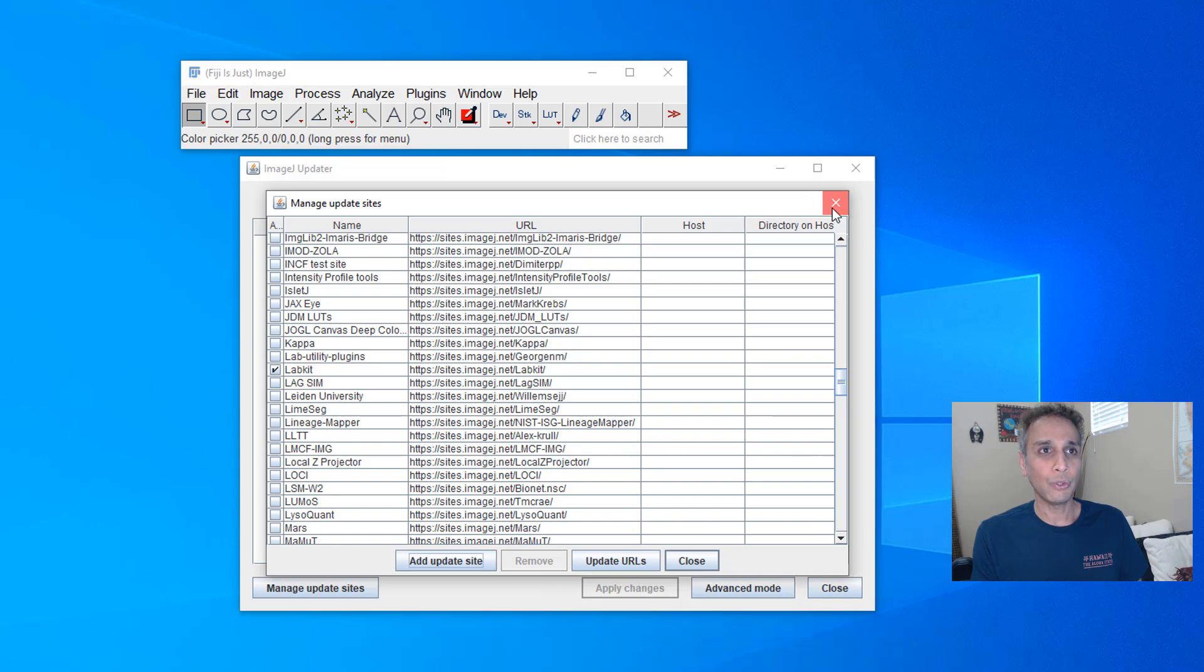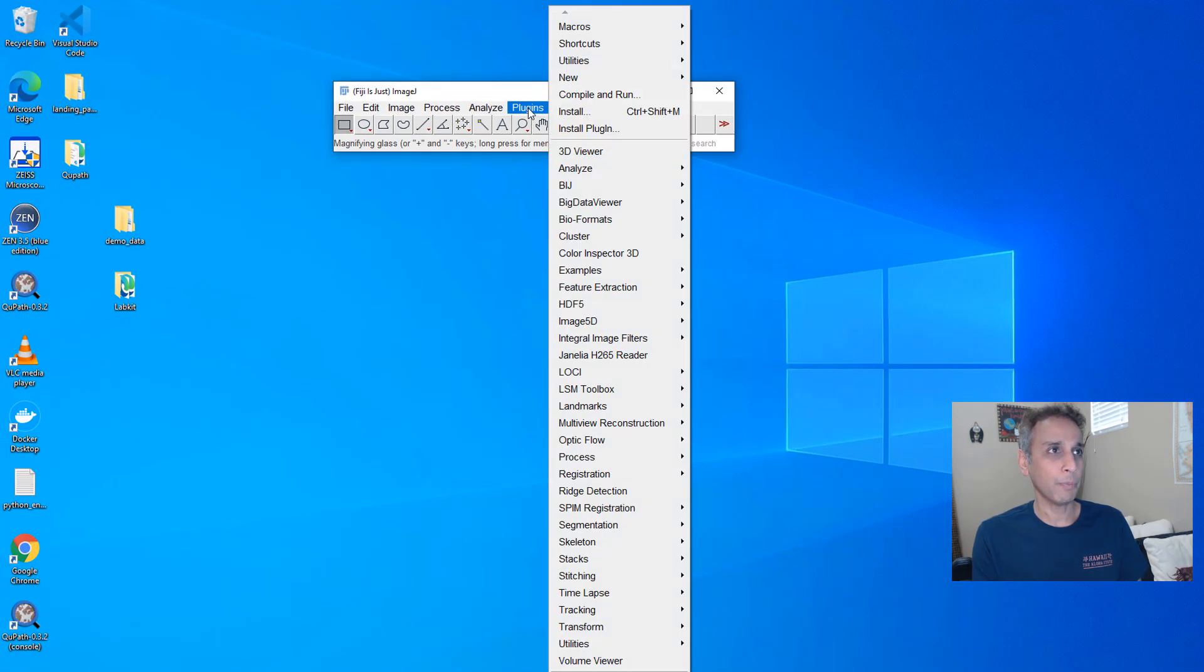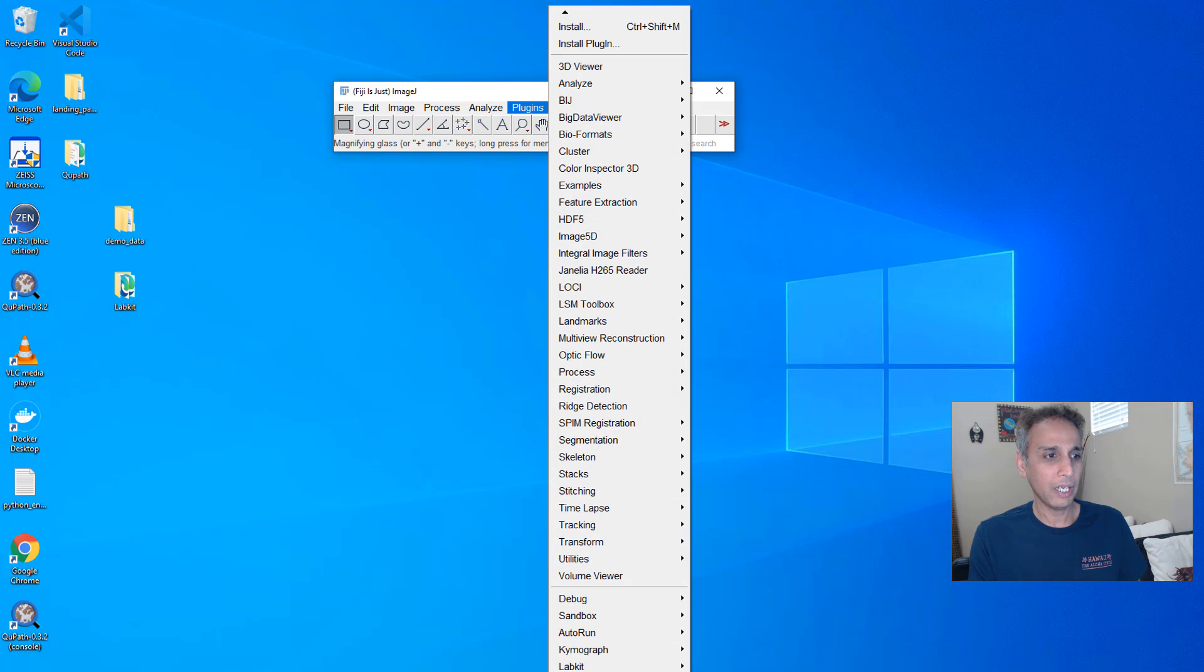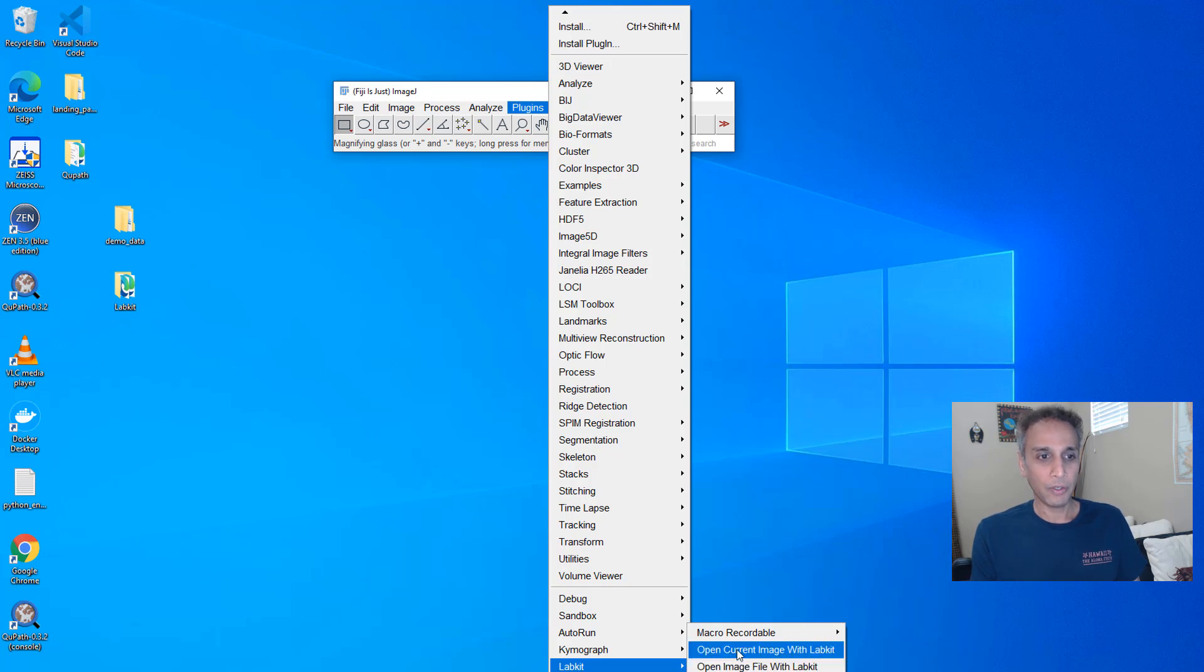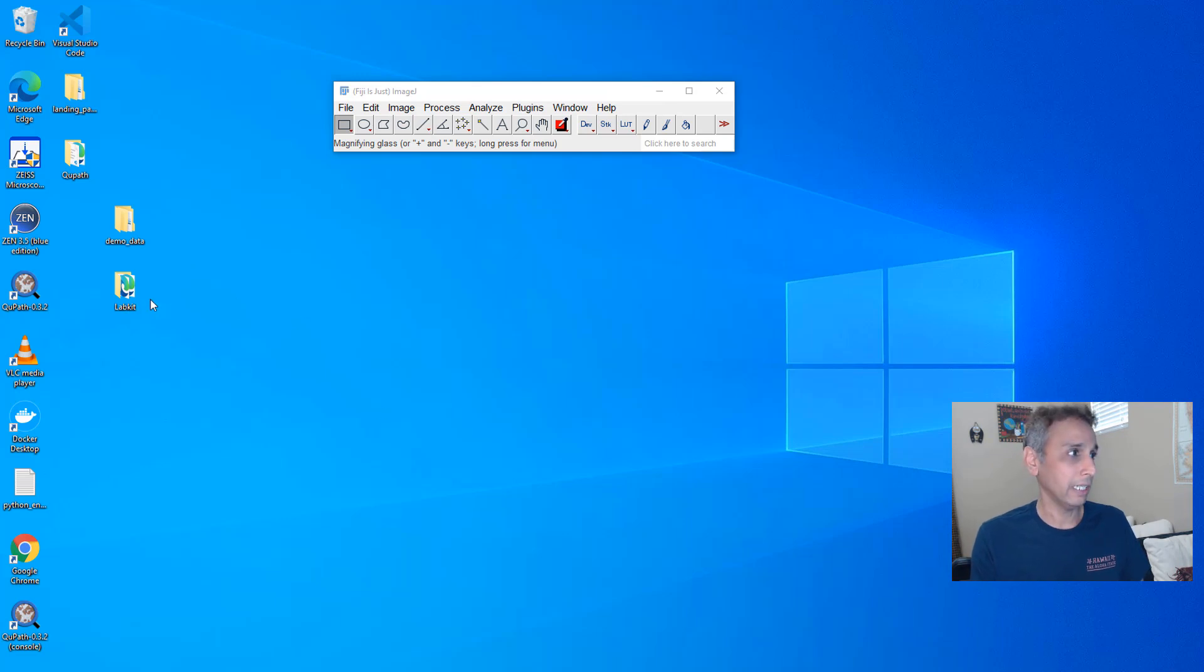And once you do that, you should, as part of plugins, if I scroll all the way down you should see LabKit down here. And I can say open current image with LabKit but I don't have any image right here.